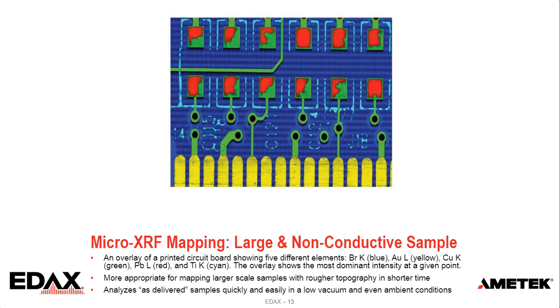This is an XRF mapping example of a large, non-conductive sample. This is an overlay of a printed circuit board. It shows 5 different elements. Basically, Micro-XRF is more appropriate for mapping larger-scale maps with rougher topography in a shorter time.